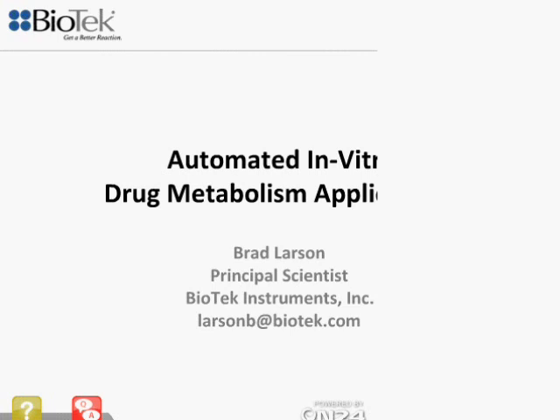So just to begin, as most, if not all of you know, ADME-Tox testing continues to move further upstream in the drug discovery process. Therefore, more and more compounds need to be tested to generate a safety profile for the compounds. This has created the need for higher throughput in vitro assay chemistries that can be automated using appropriate instrumentation and use appropriate models to generate the most in vivo-like data. Here I'll be showing you 3 case studies where we combine these 3 to create simple, efficient processes that are robust and deliver appropriate pharmacology.